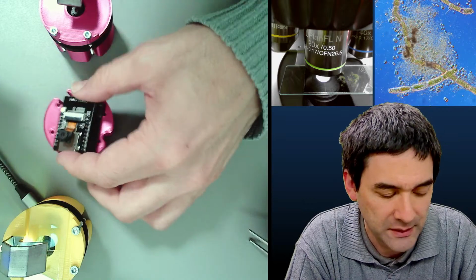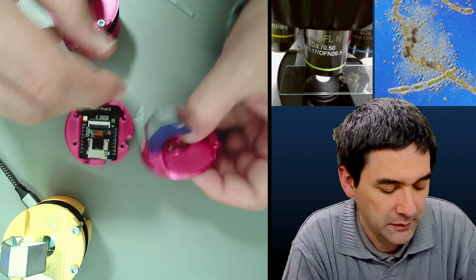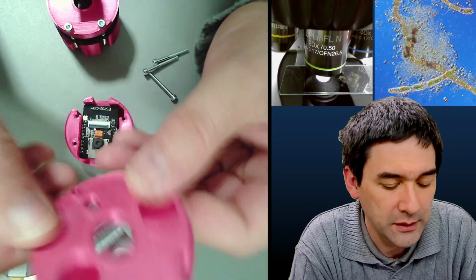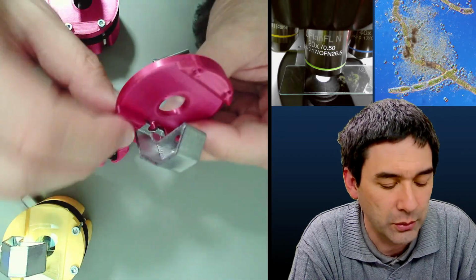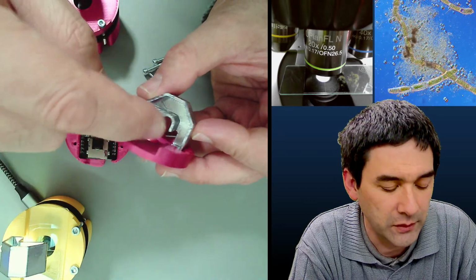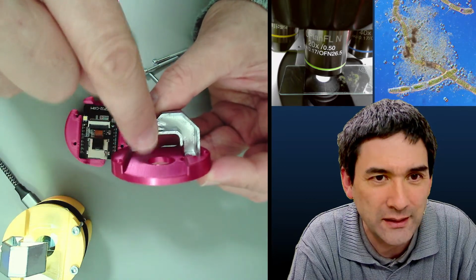And what happens is the following when it's in here. I have to take this out here. There is a little hole in here, right? And the light is passed through this hole, and then you see this little contraption over here, which is painted silver. So the light goes out and simply bounces around on the inside and then is projected down again.